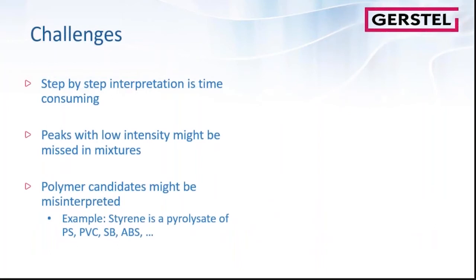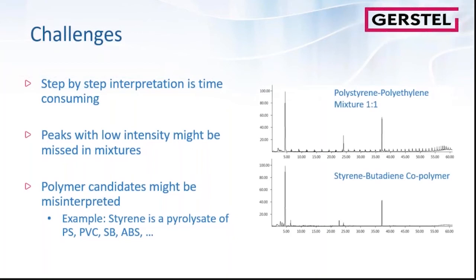So these are then the challenges that we have to face when we have to deal with pyrograms. First, the manual interpretation is very time-consuming, step by step, going through the peaks. Then peaks with low intensity might be missed in this process. Here's an example for this.